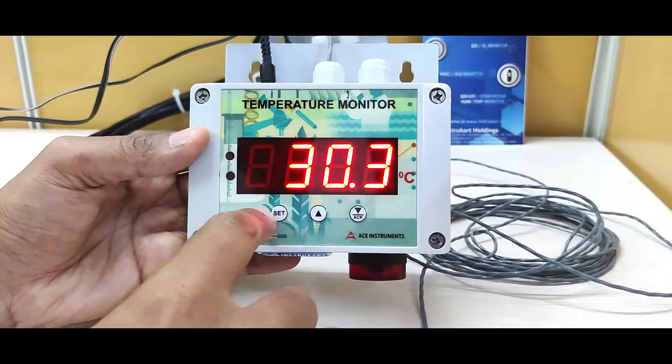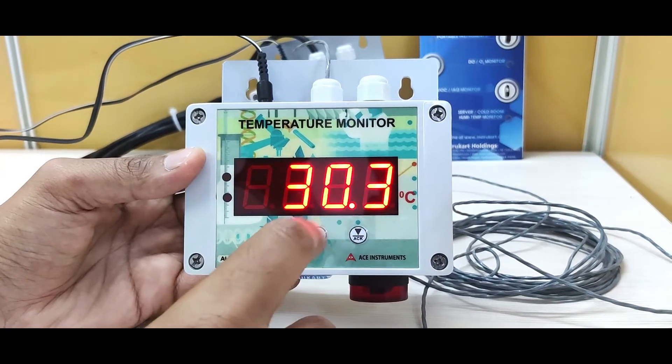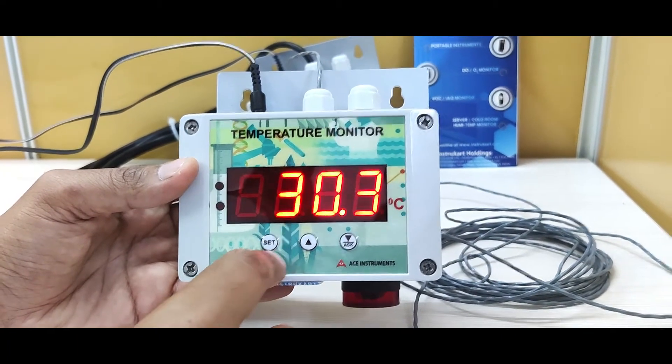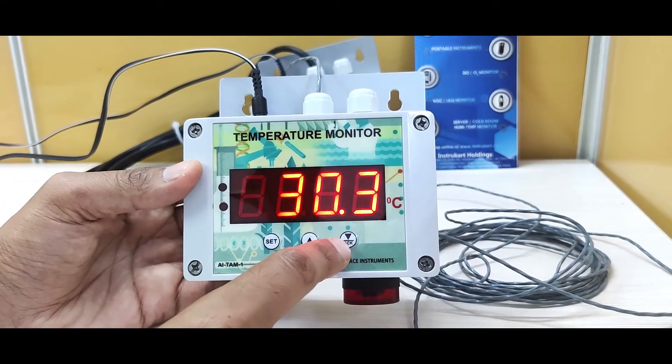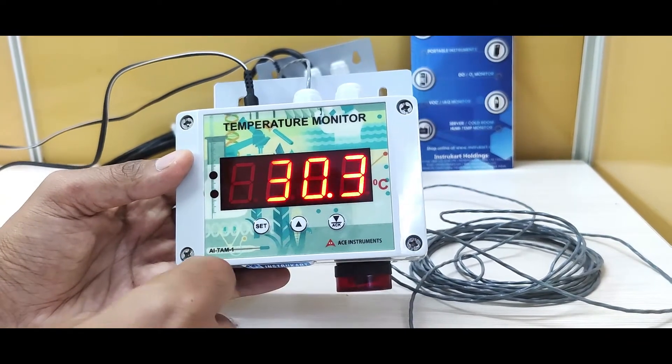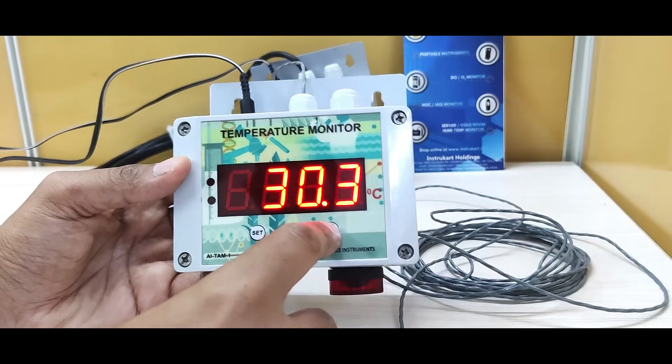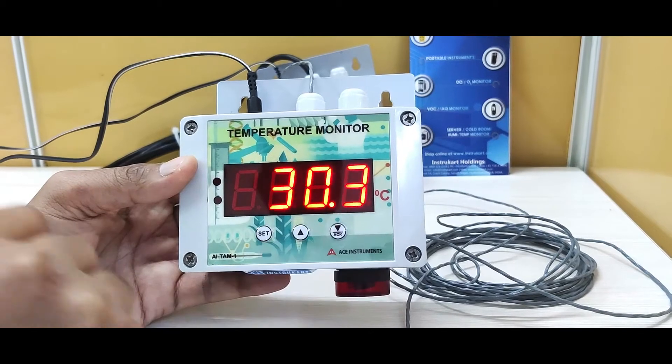On the front you can see three keys to set the low limit and high limit for temperature, and an acknowledgement button. If the alarm is triggered and you want to manually acknowledge and stop it, you can use this button.